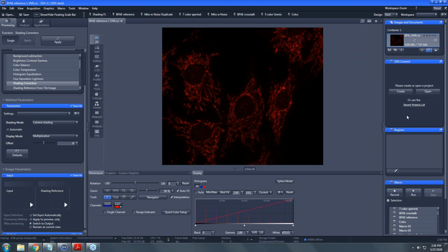The next question was, the spectra are acquired using a 7-channel set with a multi-track acquisition. That's correct. It was a wide field system, so it was 7 sequential images from a camera. If instead we use the channel splitting on a confocal, so this is the spectral array that I was talking about, is the unmixing result improved as the channel width in nanometers is decreased? Right. Very good question. Thank you. So the answer is maybe, a very definite maybe.